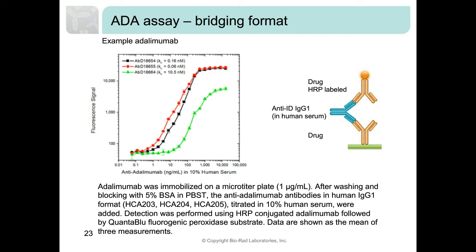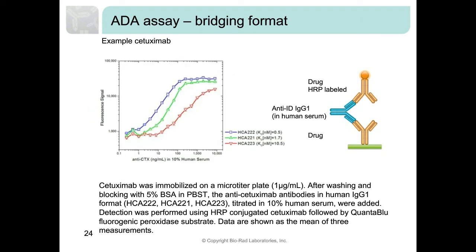We see the same thing for other ADA assays. Here is another example with 3 anti-cetuximab antibodies. Again, sensitivity of titration is correlated with affinity of the anti-idiotypic antibody.